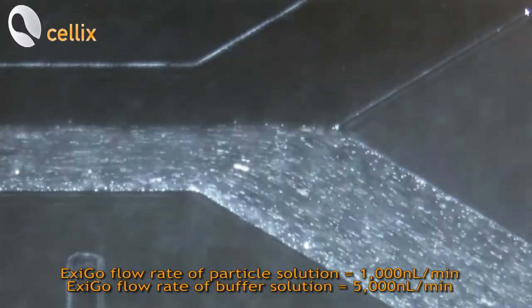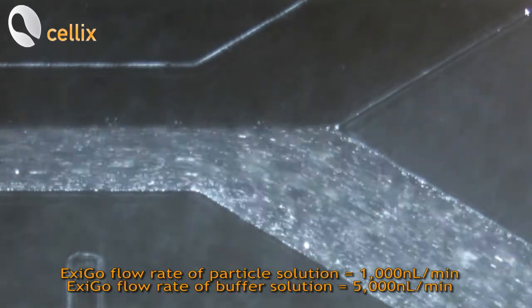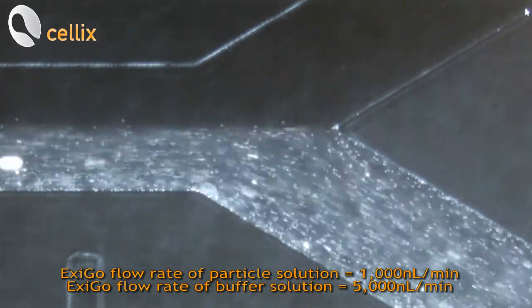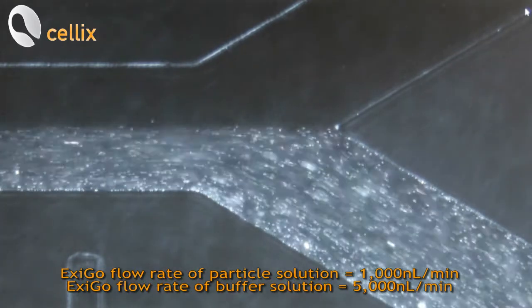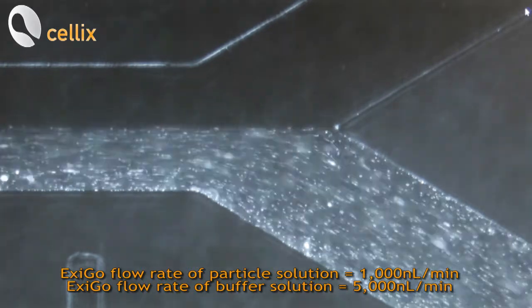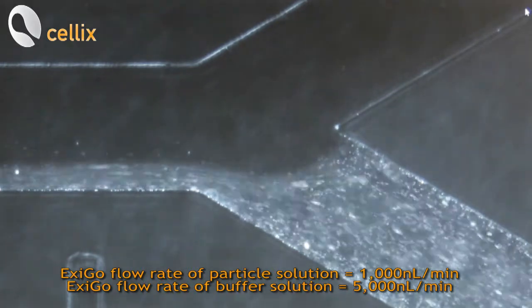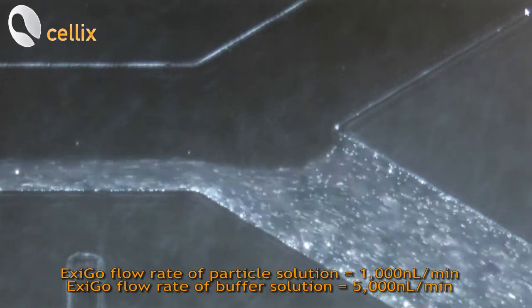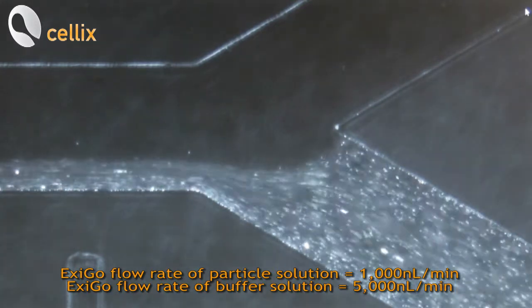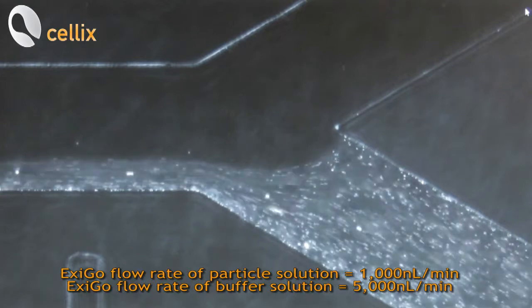We can now change also the flow rate of the buffer solution. So we can enter 5000 nanoliter per minute. As we can see here the interface has been moved on the opposite side.